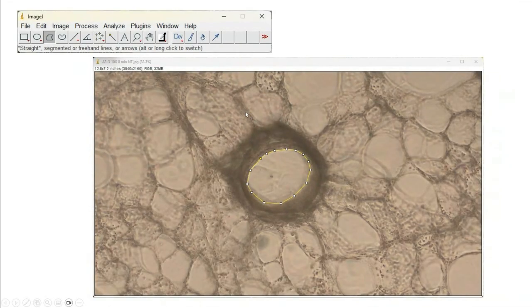Once you take the slices for experimentation, you will put them under the microscope and apply a contractile agonist to contract the smooth muscle. For mouse, that will be beta-methacholine, not histamine, because for some reason the mouse smooth muscle is not responsive to histamine.